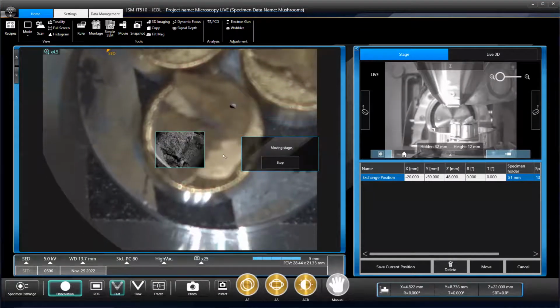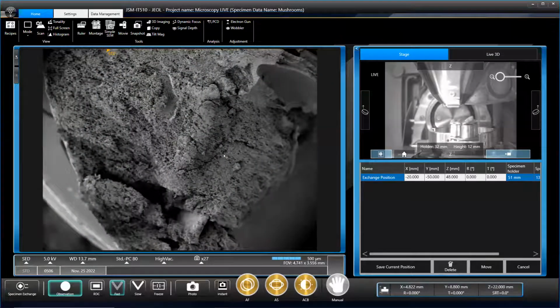We've got about a quarter of an hour left. Would you like to try to open my... Yeah, I could have a go. I've never done it before. Yeah, that's fine. Go ahead. Here you go.